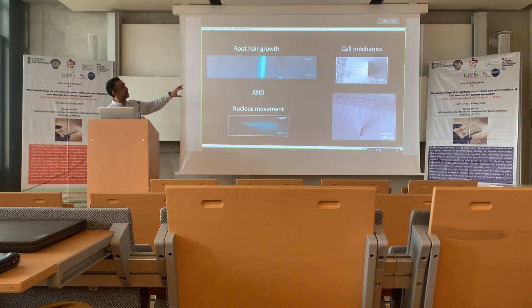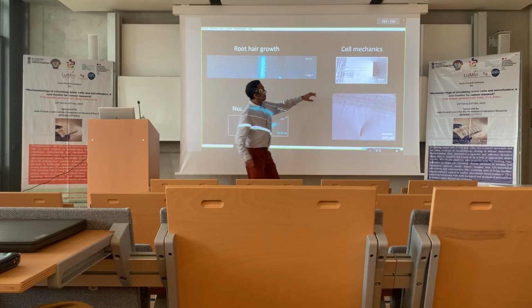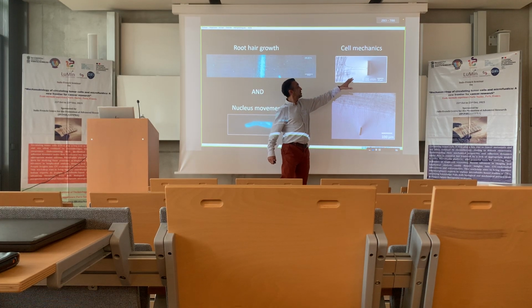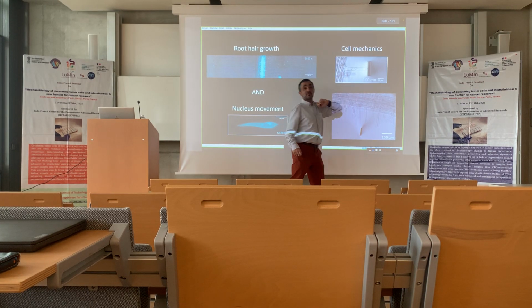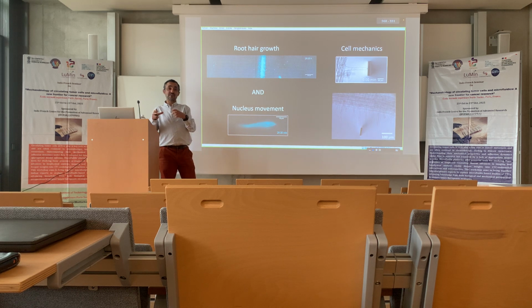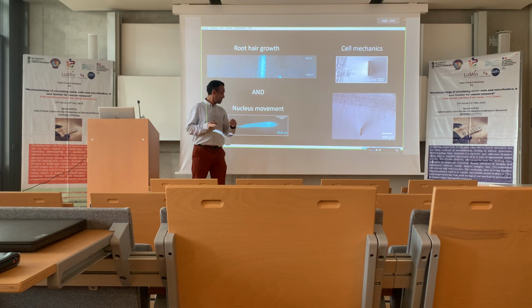So we can follow everything and make kinetics with different gels. We can also measure the force generated by the root hair itself and how it depends on the stiffness of this plate. Here it's just a zoom, where we follow in the reference frame of the nucleus and see how it deforms.